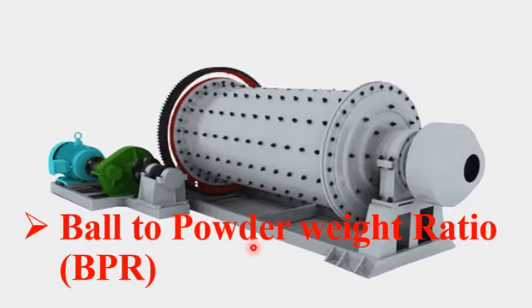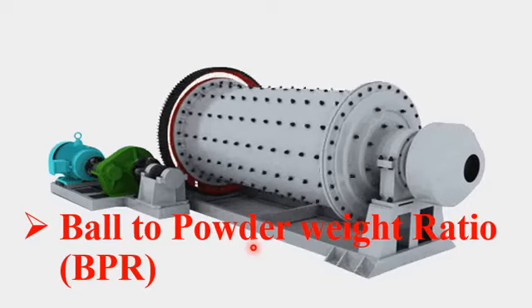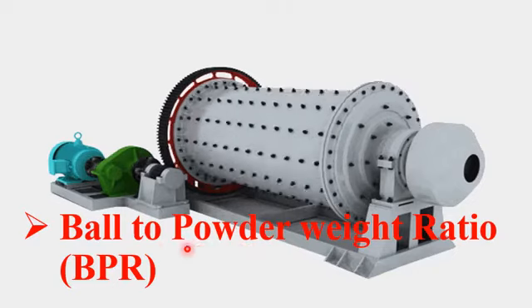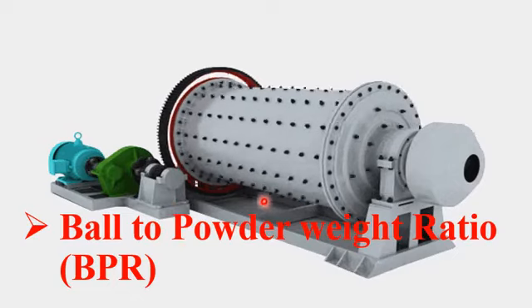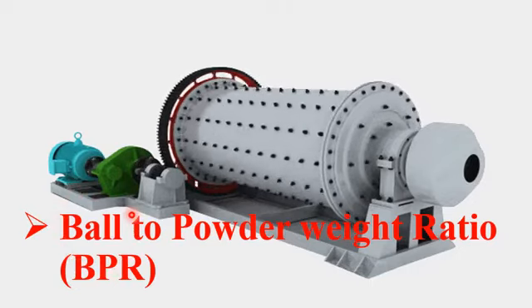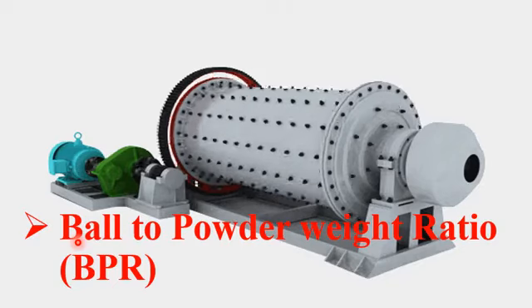Please note that the ball to powder ratio will depend on the size of the powder, like what is the diameter and what is the range of size of the powder. Secondly, it will also depend on the diameter of the balls, so this may vary with the size of the balls also.